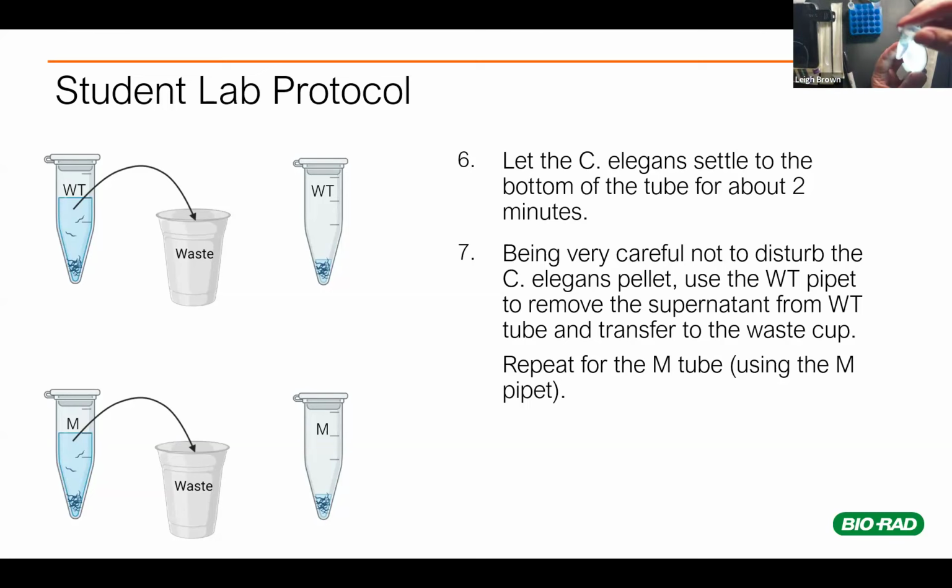One thing also to bring up here, because depending upon the students you have, I always joke and say it to the AP students, but it's not always them, it's any student that's really meticulous: not every worm is going to make it in this protocol. So don't spend the time trying to get every worm from that plate that was in the tube to the next round. There will be some casualties, and that's part of life for the worms in this case. We'll try to keep as much of that pellet as possible, but if you lose some worms along the way, don't sweat it.